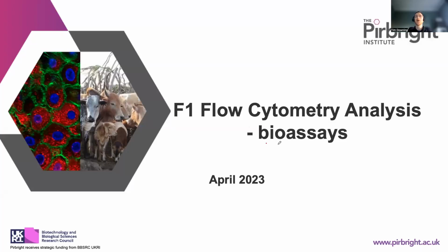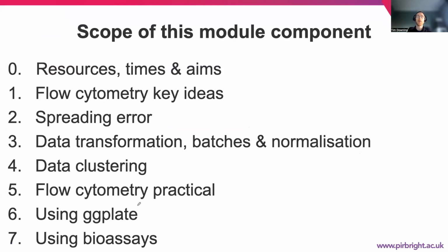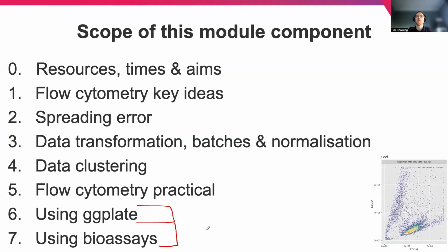So welcome to this section on bioassays or packages as part of the course F1 on flow cytometry and analysis. So similarly to ggplate, this part is looking at how we can use molecular data to be visualized as an assay using a range of functions associated with that package. So this package works well across different plate sizes.